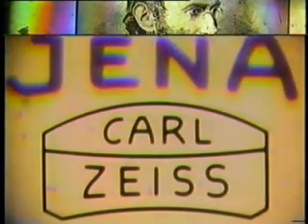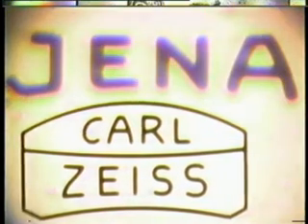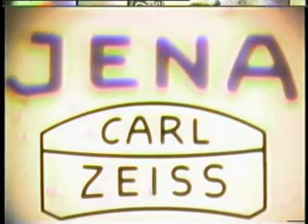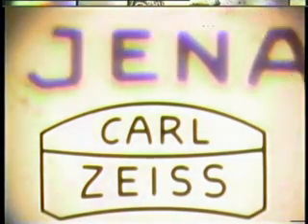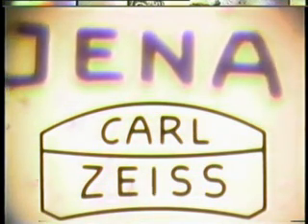It's a little bit more complicated than that. Let's deal with the easy bit first: I've put the Carl Zeiss emblem on the stage, but you notice Jena is somewhere else. That is positioned, in fact, down near the illuminated field diaphragm. So that's one reminder of conjugate planes.